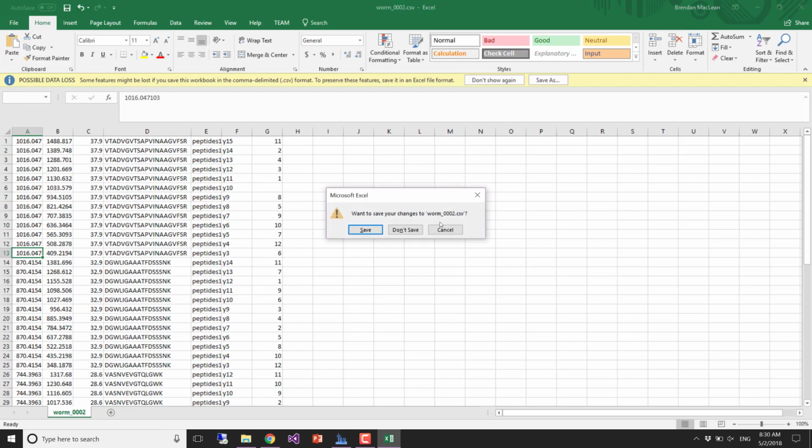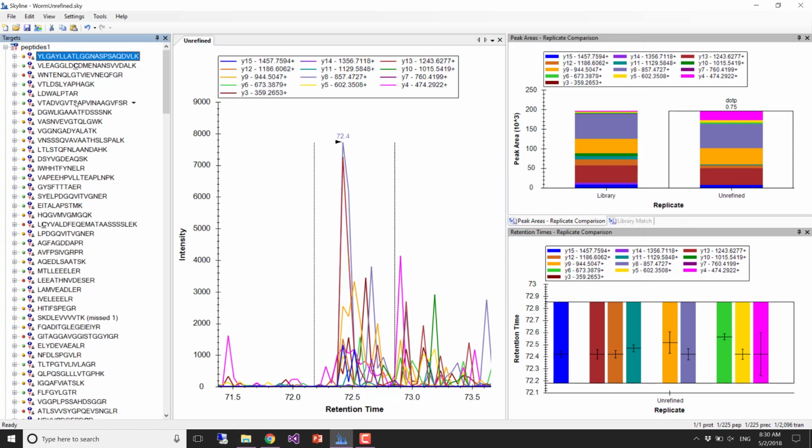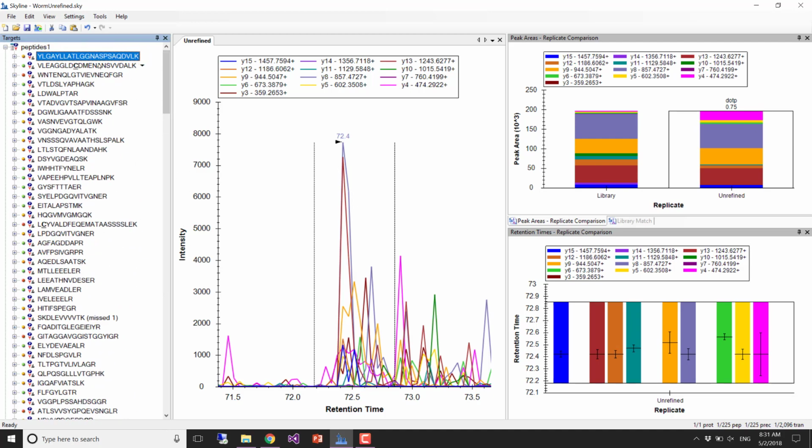So that's what's happened. Every one of these then mzML files, which was originally a .raw file, got some number of transitions. And that's why when we opened it up as replicates, we could see little blocks of measured peptides. Each run was measuring a different set of peptides. But now it's all stitched together, and we can't even really see the file boundaries most of the time.